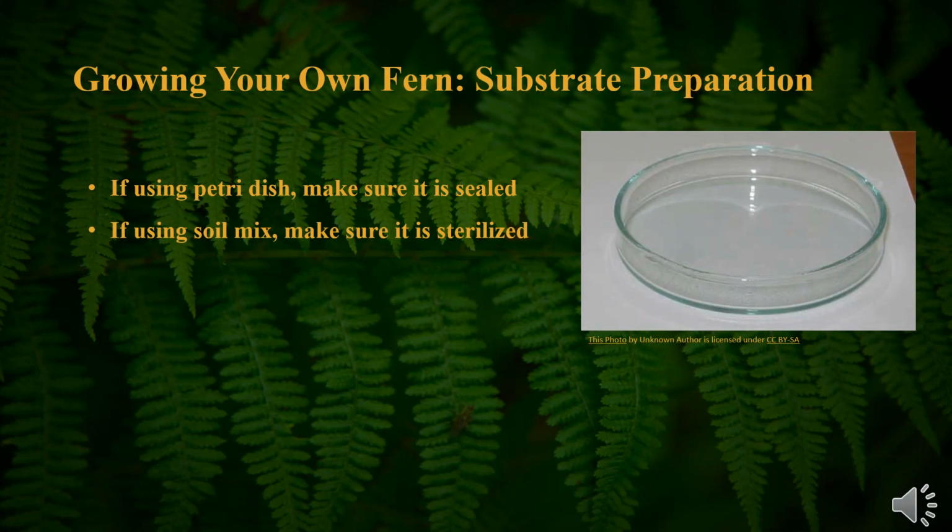Preparing the substrate. If using a prepared petri dish, make sure it is sealed before using it to ensure no pathogens are introduced to the growing media. If using a soil mix, make sure it is sterilized to prevent pathogens from growing in the moist media.